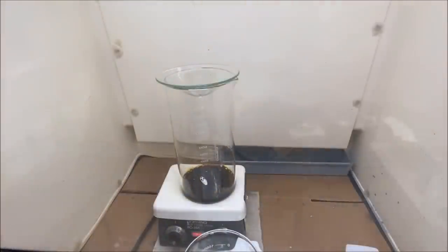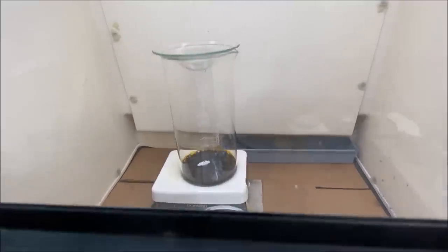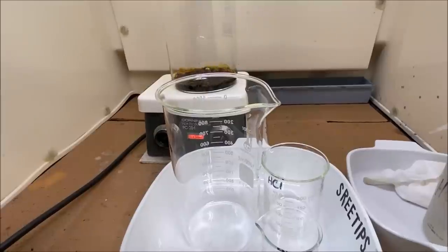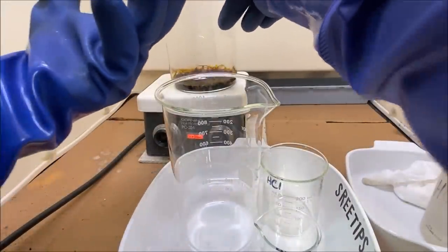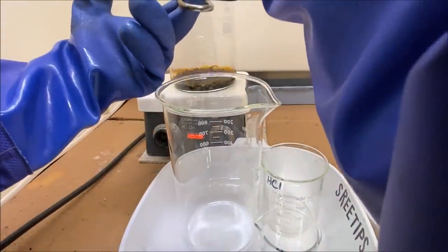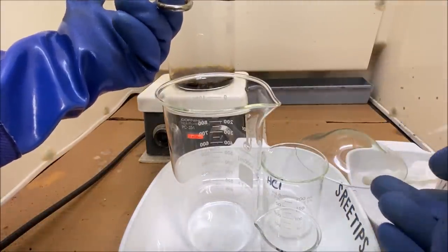All my fumes have cleared up in there. I think my stir bar, my hot plate stir, is crippled. It's not working properly. I still see some metal down in here. Oh gosh, I hate working with this stuff.